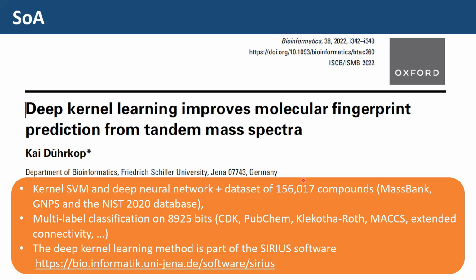The authors also provide the models they used in the Sirius software, which is available online, so it could be a nice benchmark.